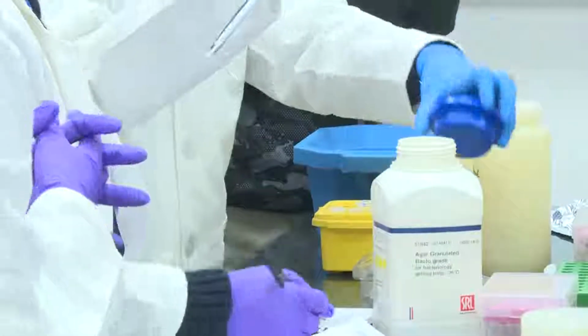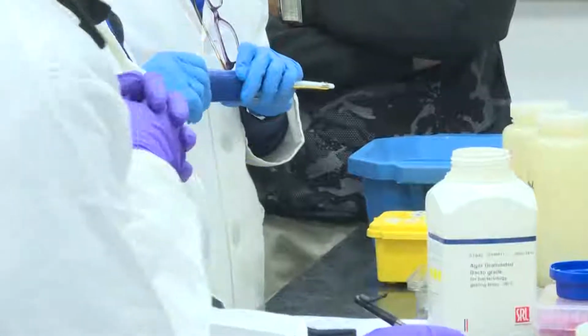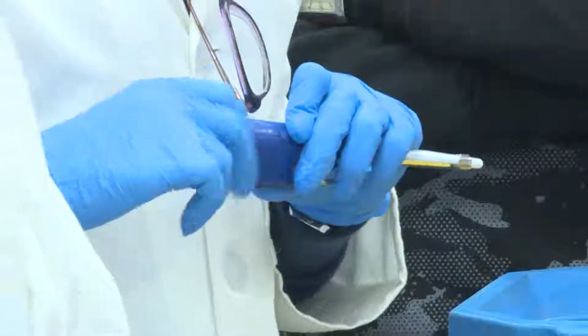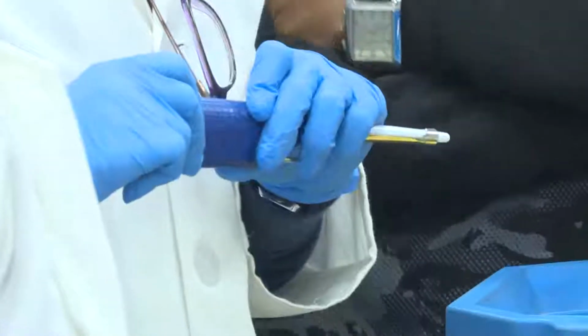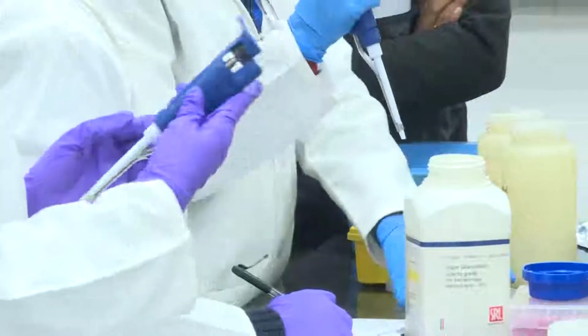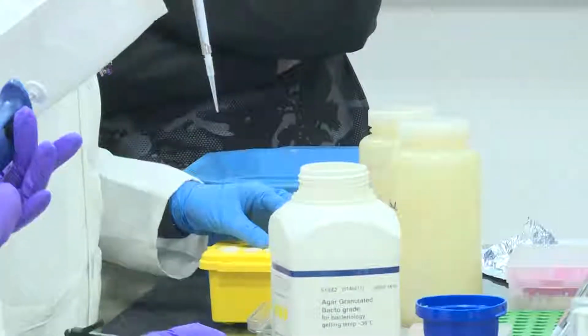So the equipment, the brand, the way you select will actually give you some advantages over choosing different methods. A PCR without a hot start function, a PCR machine without a gradient function will be a little handicap for us. So understanding what you want to select is also important, right?